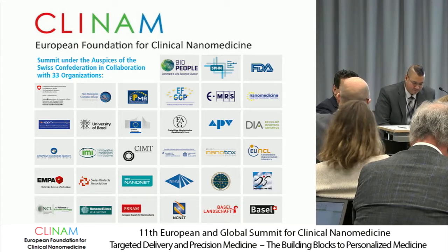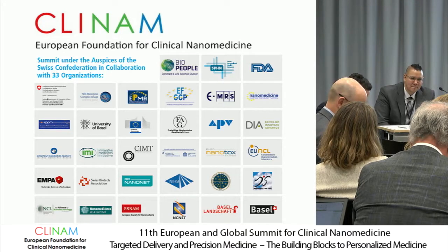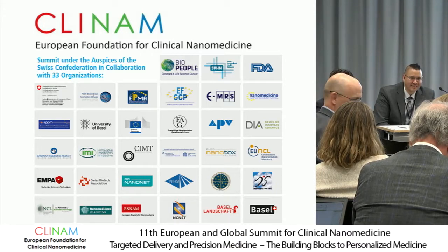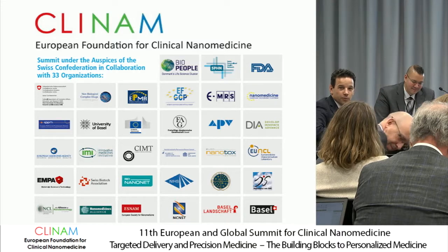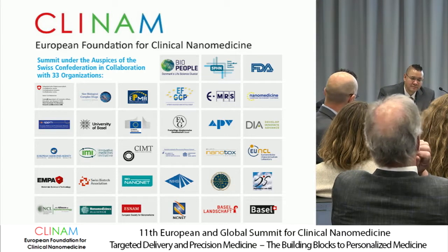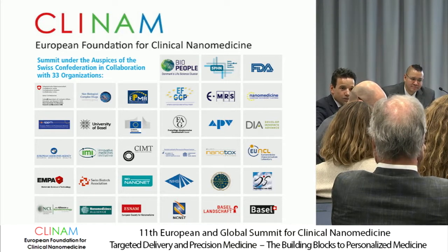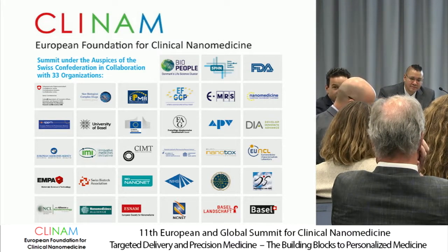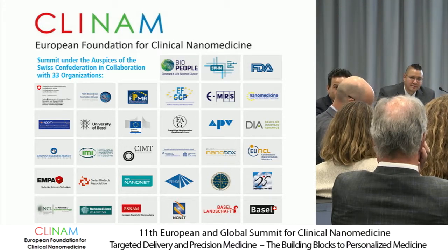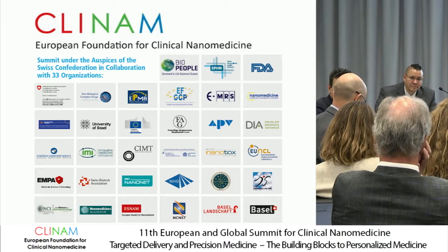And David, to further complicate your life, if you haven't grasped it from Andrea's presentation, you need to work in sterile conditions. You cannot work in a dirty environment with LPS, because the minute you have LPS, you measure LPS. So that's the complexity that Jeff referred to on hydrophobicity, and also on the active ingredient, its functional activity, which you have to preserve, or you need to work with a chemotherapeutic. How do you handle the toxic element associated with it?